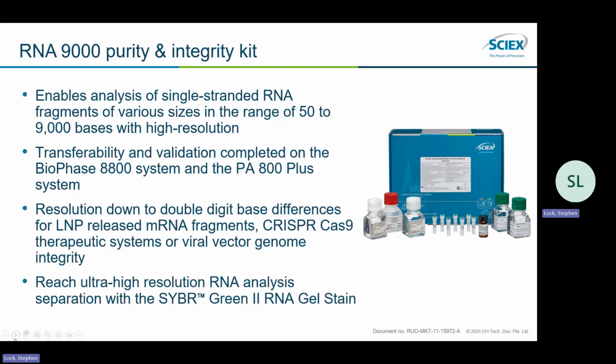And in the system, we use laser-induced fluorescence as detection. Often, to be honest, when the concentrations of your RNA target drop low enough, you start to use dyes to tag your DNA or RNA material, and when it's single-stranded, you tend to use SYBR Green or SYBR Gold dyes to tag them. The tagging of the genetic material really enhances the sensitivity. And in this particular approach for mRNA, because often the concentration of the mRNA in these drugs is quite low, we tag it with SYBR Green.